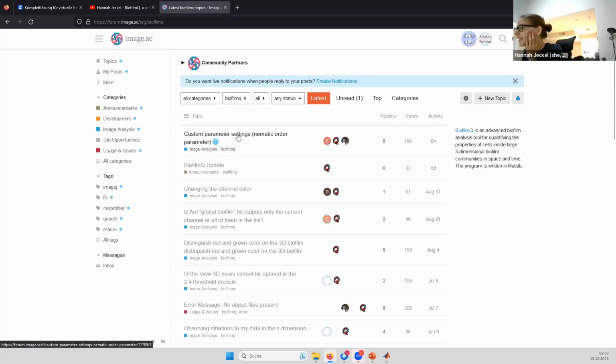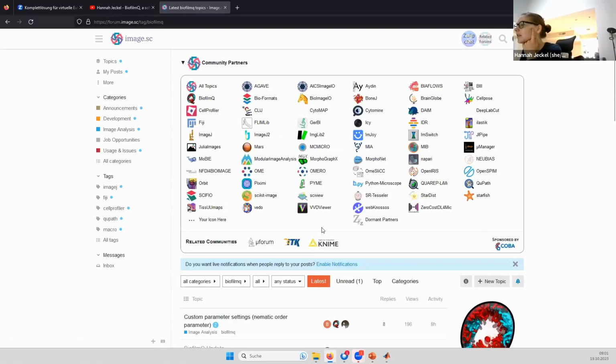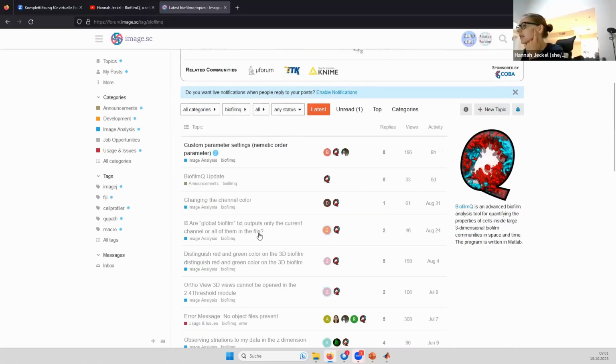As you can see, somebody just posted something 8 hours ago, and Niklas already replied. I also already replied, interesting, but not within the last 8 hours. We check this every other day or so to make sure that these questions are answered quickly. But right now you have the chance to ask me right here and then.